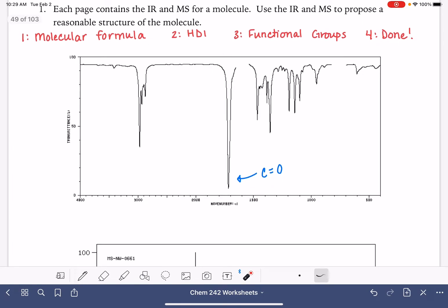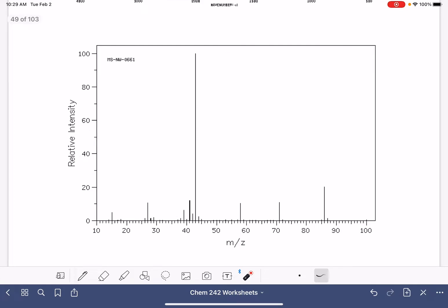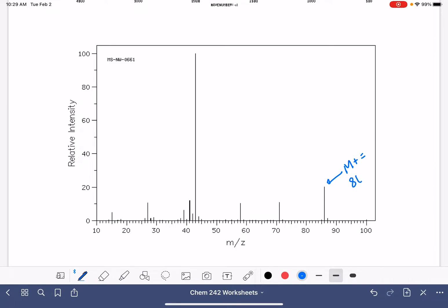Knowing that we have oxygen, we go to the mass spec and look for other atoms like nitrogen, bromine, and chlorine. Bromine and chlorine are usually really easy to see. We can see in this molecule we don't have any M+2 peak, so that means we don't have chlorine and we don't have bromine. Nitrogen is visible if the M+ peak is an odd number — this M+ peak is at 86, so there's no nitrogen. We have a molecular weight of 86 g/mol and oxygen present.